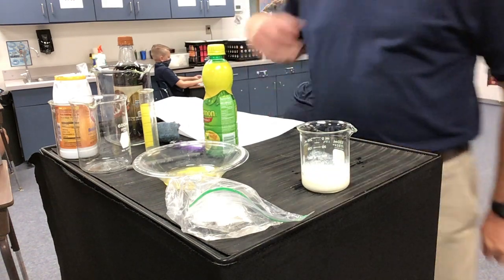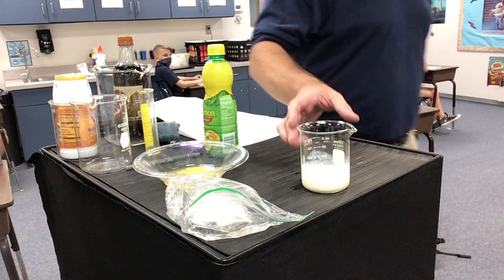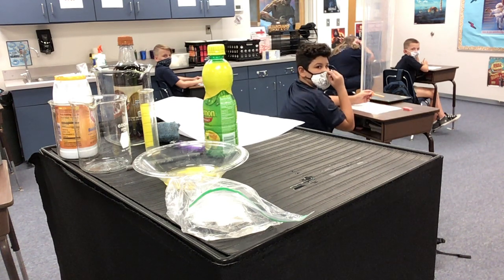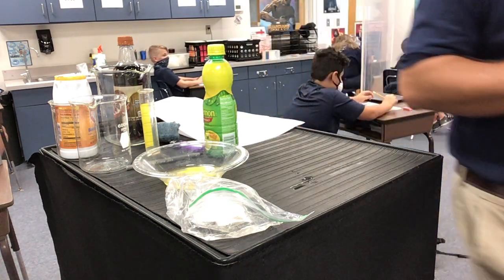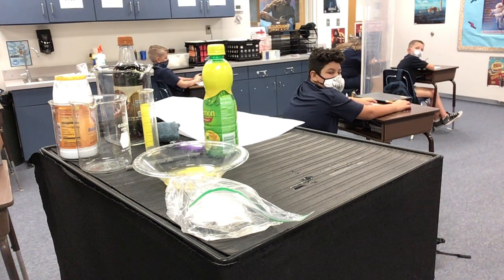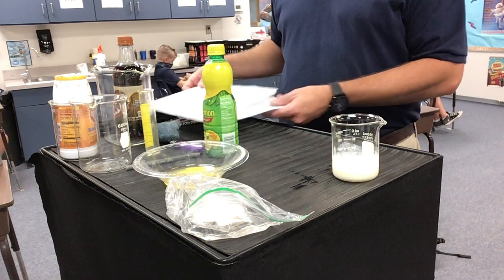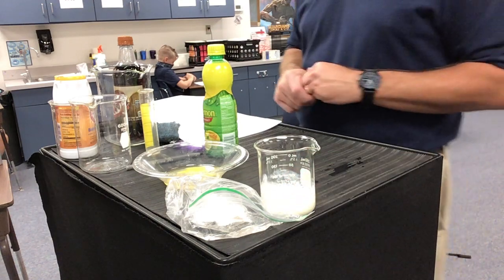The next one, odor. What should this smell like? Lemon juice. Does it smell like something other than lemon juice? Temperature change. Is it getting hotter or colder? Is it changing temperature? Or is it just staying the same? What'd you say? Nope, staying the same. We're going to let that one sit for a few seconds also.